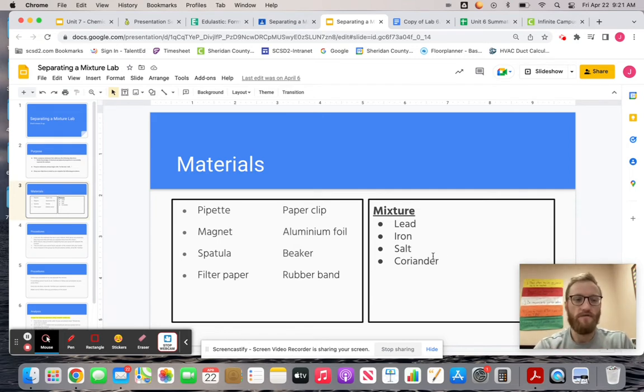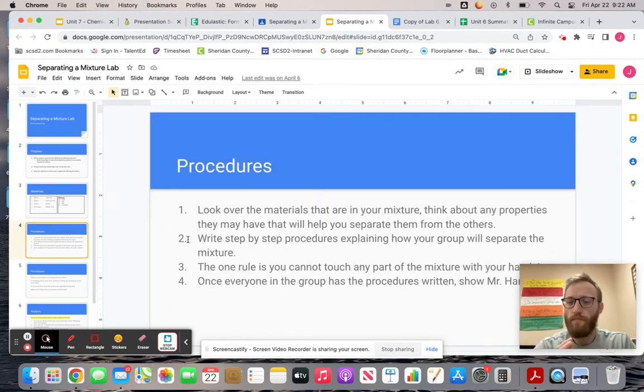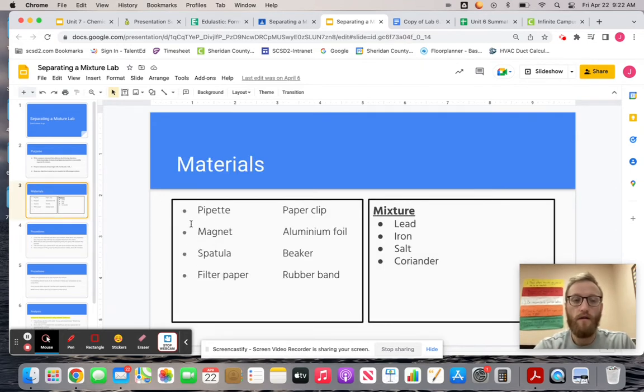So the goal of this lab was to figure out how we could separate that using this stuff. That's what I want you to do here. You don't have to use all of these, but think about how you would go about separating these. This is going to be challenging because you can't see the stuff. It's easier when you can hold the materials and look at them. But how would you separate the lead, iron, salt, and coriander from each other using only these things? And you can use water. That's what the procedure is here, so just write the steps. How would you do it? For example, one of the big ones was we know certain things are magnetic, so they said we're going to use the magnet. Go ahead, pause the video, think about how you'd separate this, and then we'll talk about the other stuff.